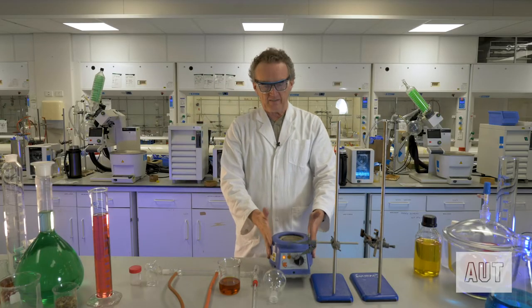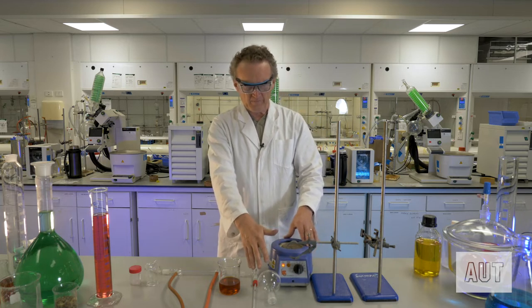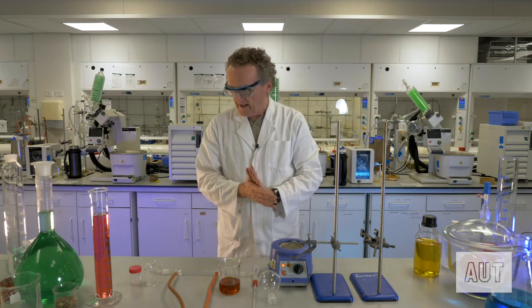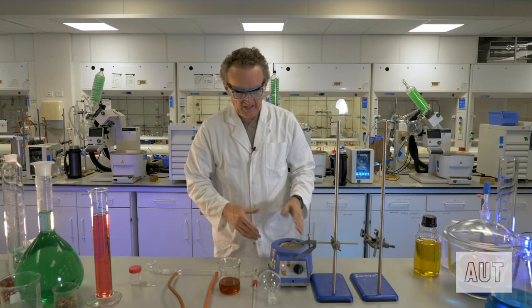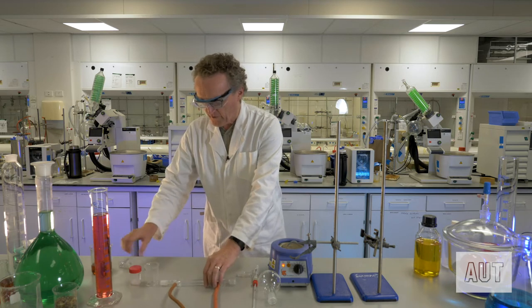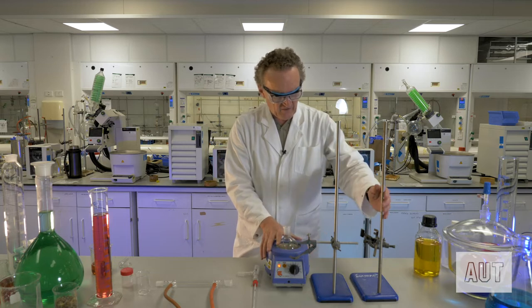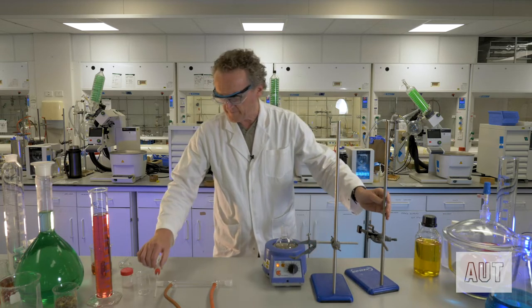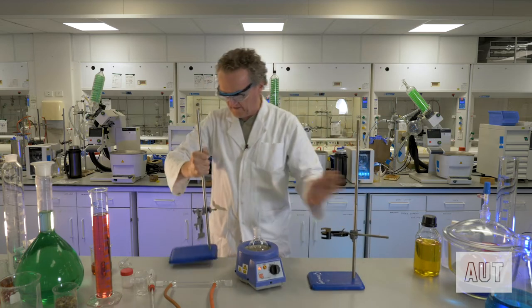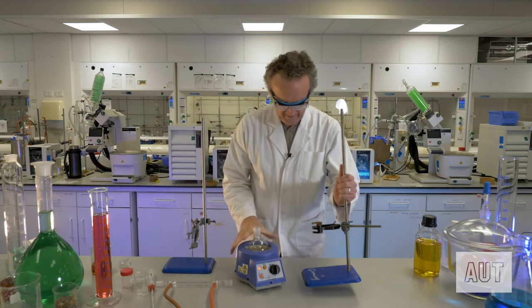We've got a heating mantle here that is going to supply the heat, obviously, for boiling our material. A couple of retort stands that we're going to hold the whole thing together with. And so let's get on with it. Now, assembling these can be tricky. So let's just work through this. We'll put our round bottom flask in there to begin with. And we'll put our retort stand, let's put one there, and we'll put our other one here.